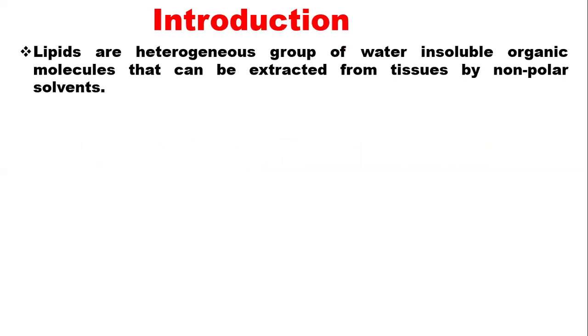Lipids are a heterogeneous group of water-insoluble organic molecules that can be extracted from tissue using non-polar solvents. So lipids on their own are insoluble in water. They cannot be solubilized by water, but rather non-polar solvents can dissolve them. Non-polar solvents include chloroform, ethyl ether, benzene, and so on.